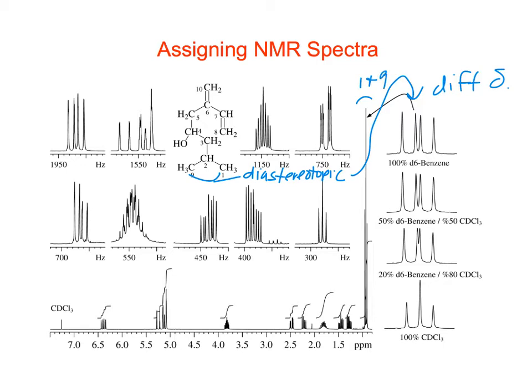That's the 300 or the 750? The 300. I'm looking at the big triplet. Yeah, here, the 300, 1 and 9. Yeah, gotcha. I was looking at the big spectrum. This one. Okay, so we've assigned, it took us 10 minutes to assign the methyl groups.